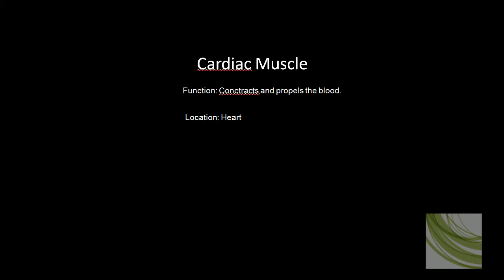This series of slides will demonstrate cardiac muscle, and we're going to look at some different characteristics to be able to tell this apart from smooth muscle and skeletal muscle. Primarily, it's there to contract and propel the blood. You find it in the heart.